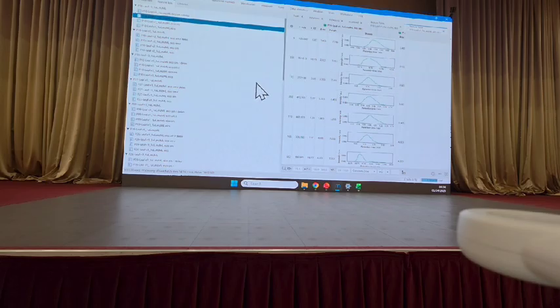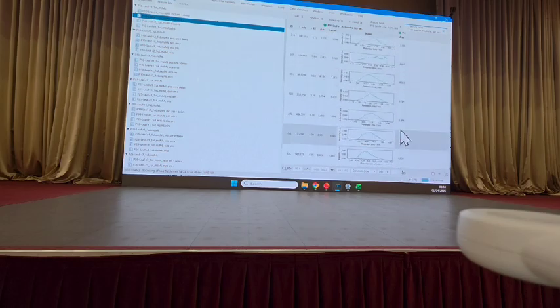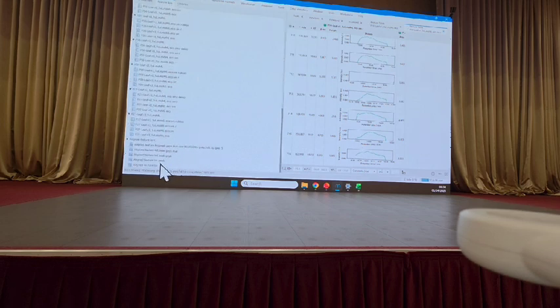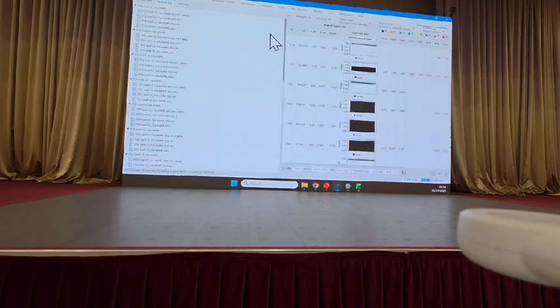And what we did afterwards is we had it built for every sample, but now we have, let's see if we scroll to the bottom, I don't think we already said feature ID. We have probably close to 1,000 small molecules detected in this sample, but we have 15 samples. So again, it's not really realistic for us to look at 15 files with 1,000 metabolites in each file. So what we did was we joined the files together to create our final feature table.